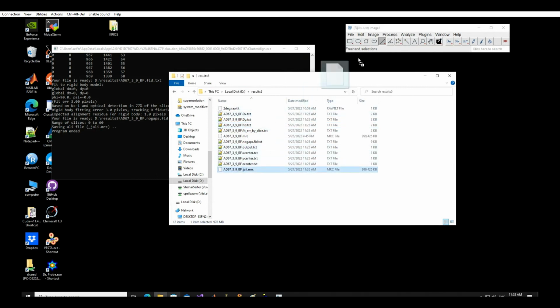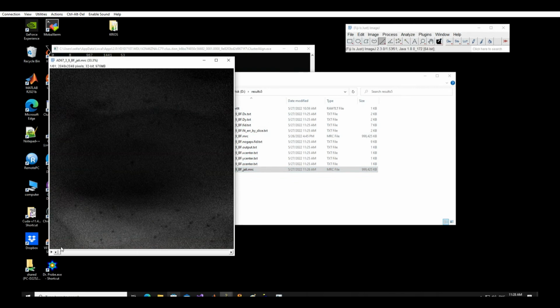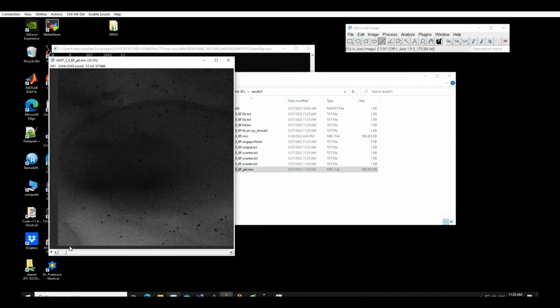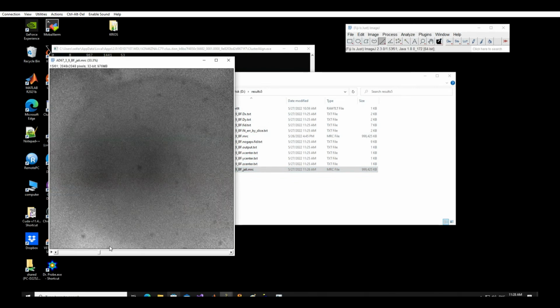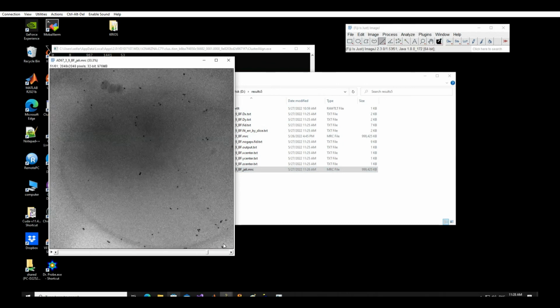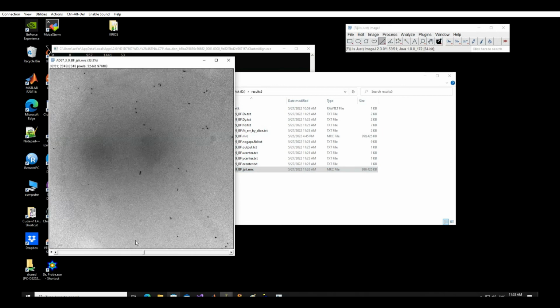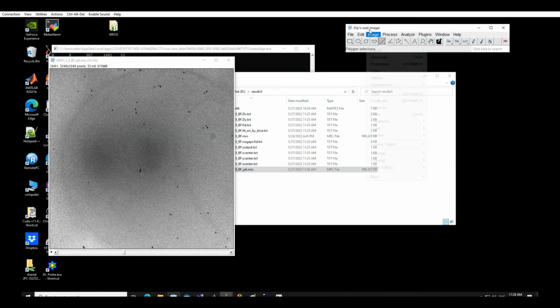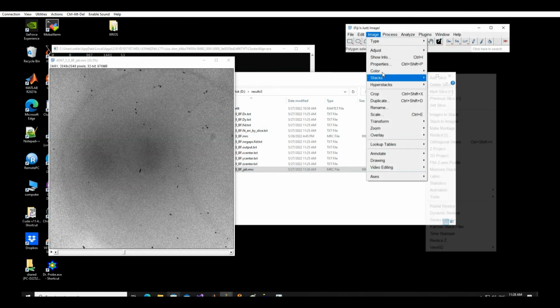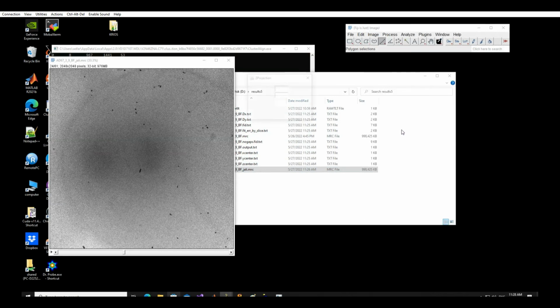We can check the aligned tilt series. We can overlay the slices based on minimum pixel value to observe the trajectory of the fiducials, and to validate that they follow a straight line.